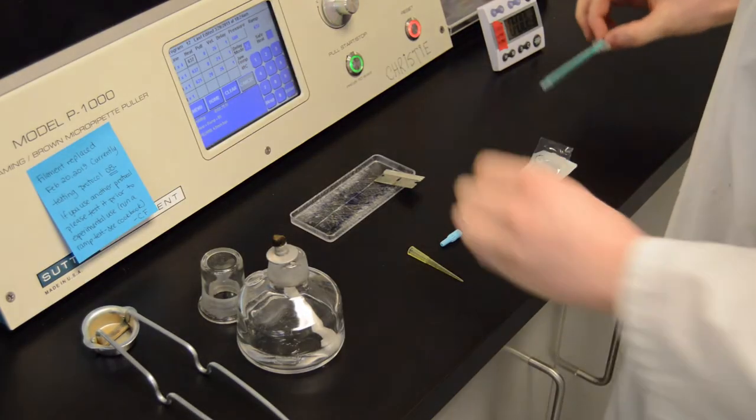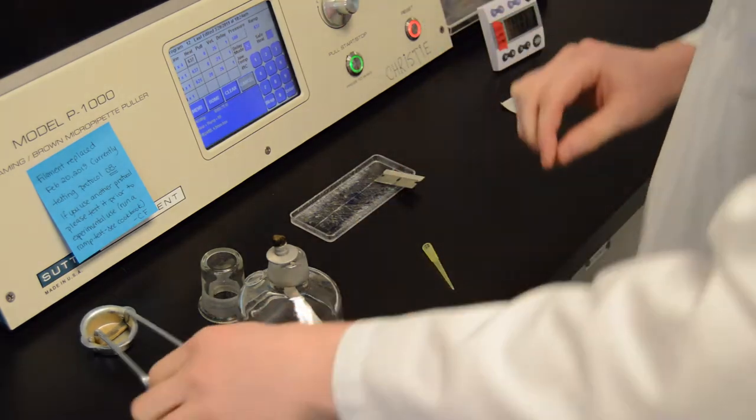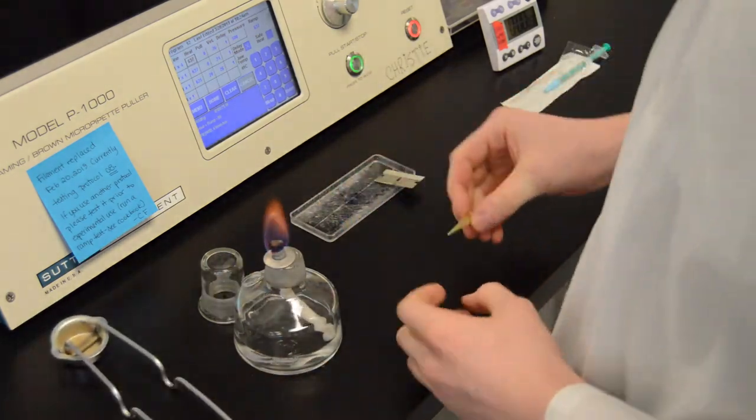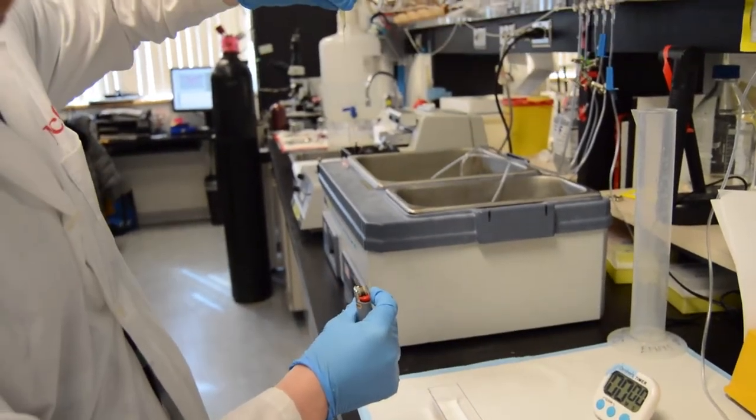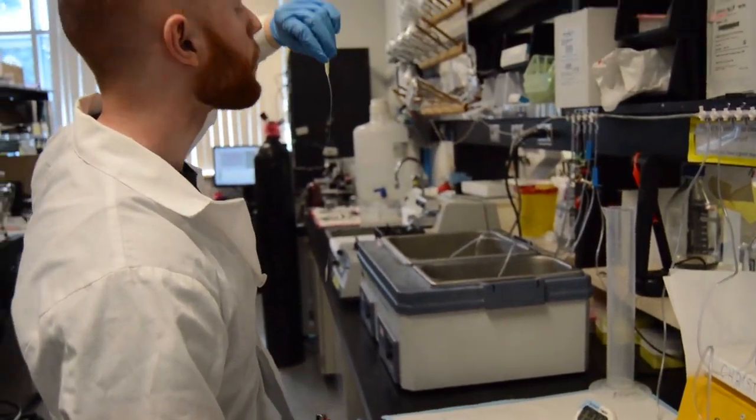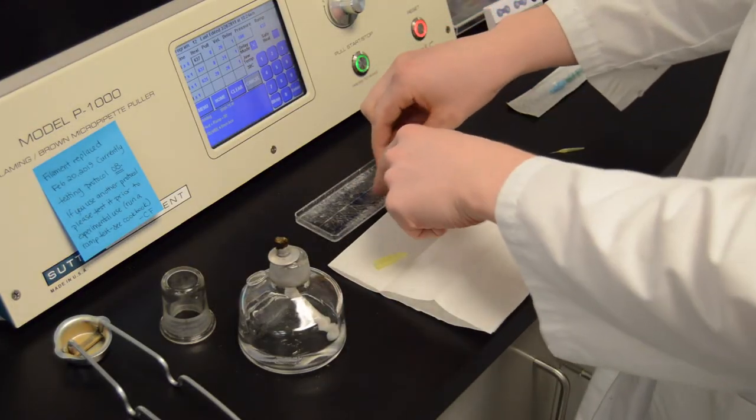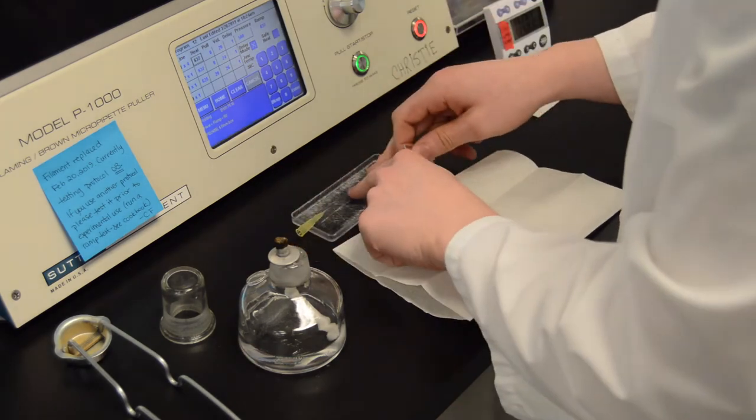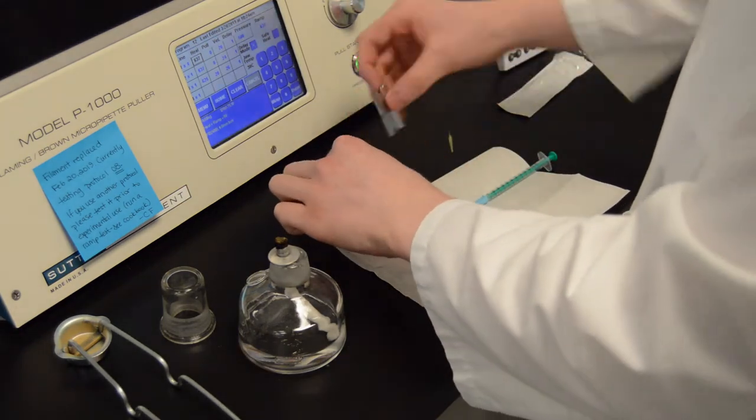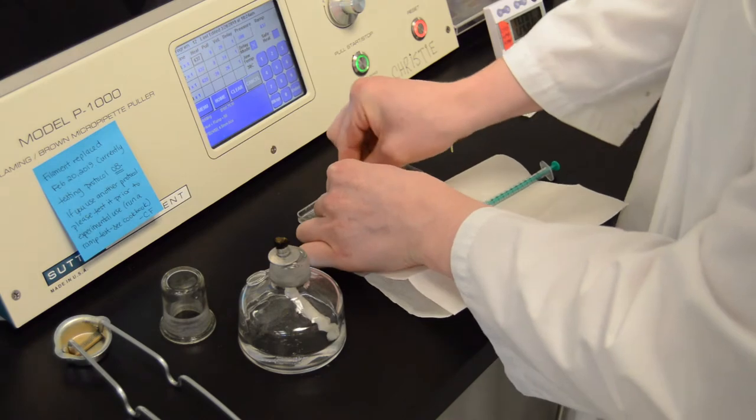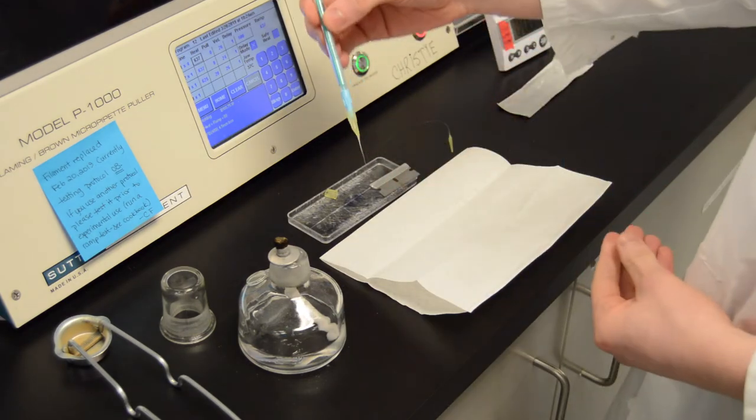We will then prepare a pipette filler for the intracellular solution. We have a syringe, a filter, and a pipette tip. We create an open flame, and then use the pipette tip to stretch its length, such that we can create a very fine diameter of the tip. Once the tip has cooled, we can then cut off the excess part of the tip, ensuring that the tip is still long enough, so that it can reach the bottom of the glass recording pipettes. We then can assemble the entire pipette filler, and fill it with the intracellular solution that will be used for our recordings.